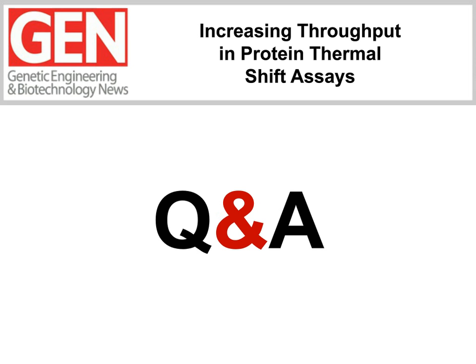Yeah, that's a good point. Whoever saw that, they're a pretty detail-oriented person for sure. Actually, A2 and E20 were missed because of the pipetting mechanism. I think that was overblown, and that's the reason we took it out of the calculations. And A2 and E20 are not part of the standard deviation at all.